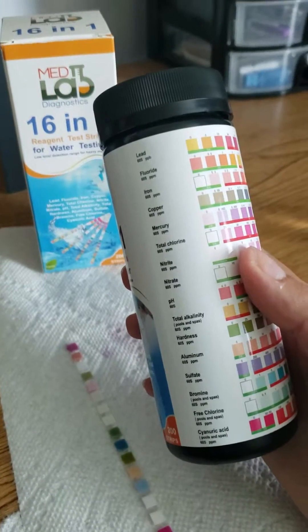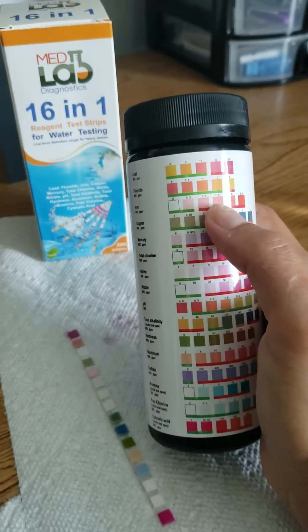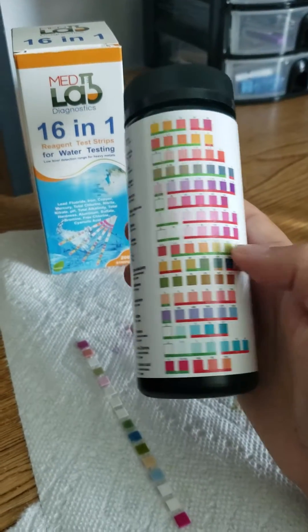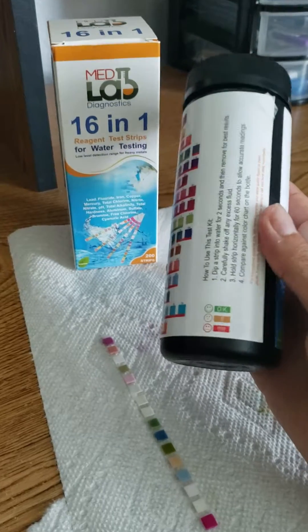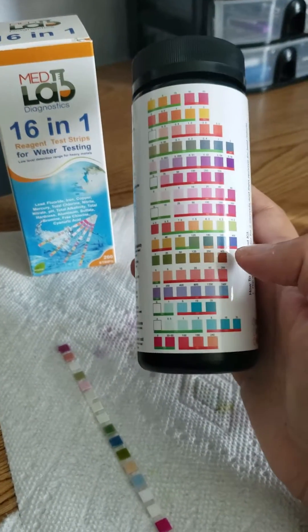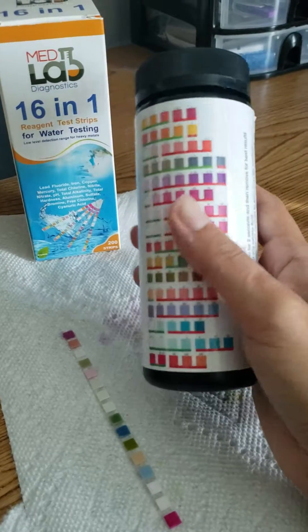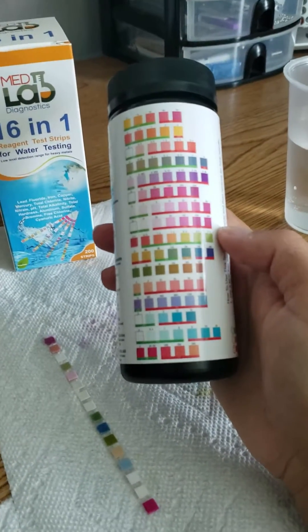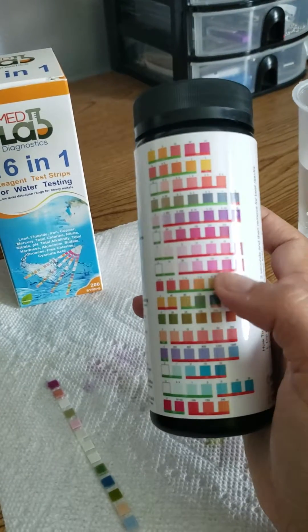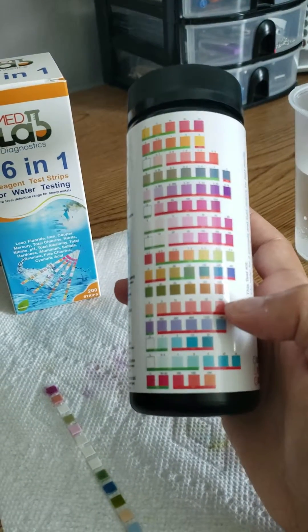One thing to note about this color chart: underneath each of the results you'll see a little line — some are green, some are red. We've built in the EPA recommended limits into this chart. If you get a color within the green range, you're okay. If you get a color within the orange range with two exclamation marks, that means it's getting close to the EPA max limits. And if you see something that is red, that means you've gone beyond the EPA max limits, which is not good.